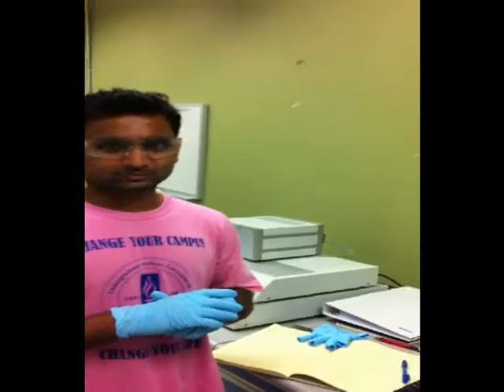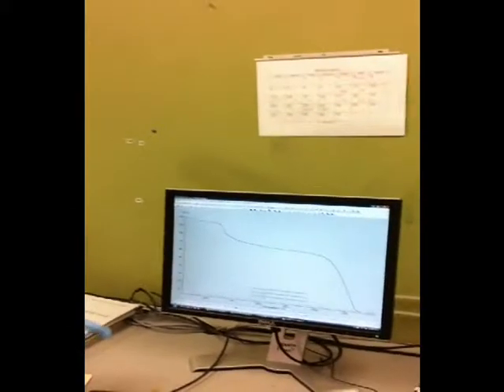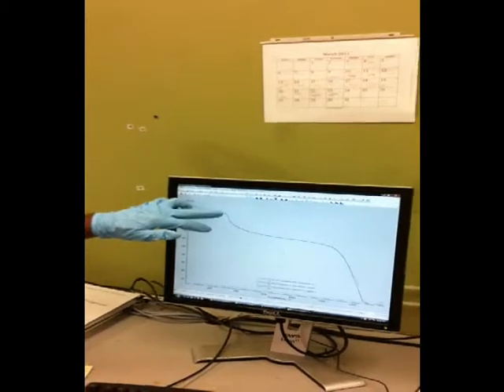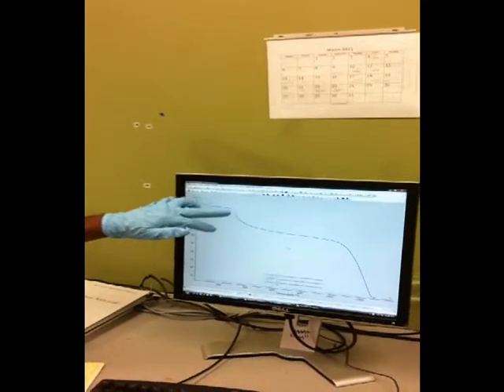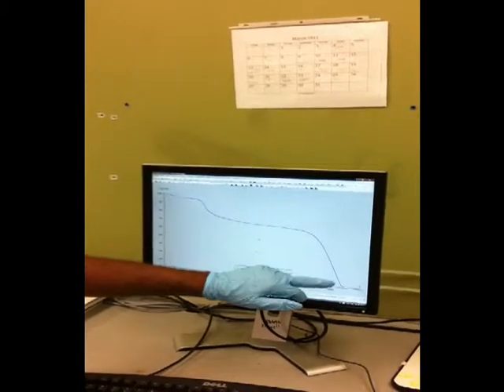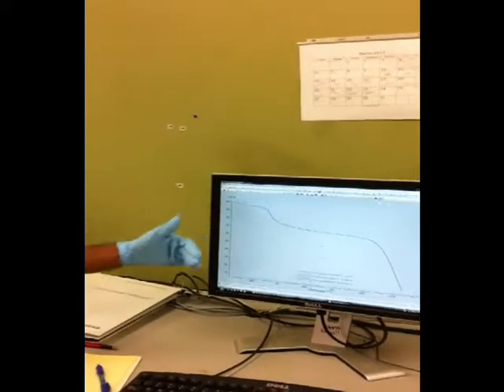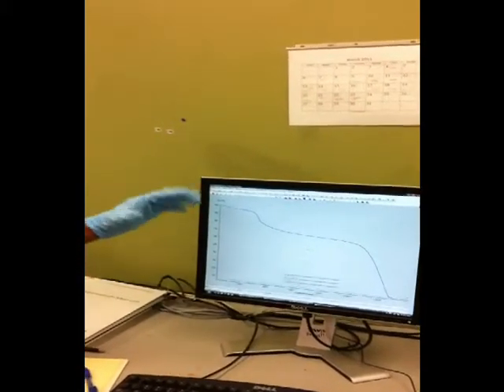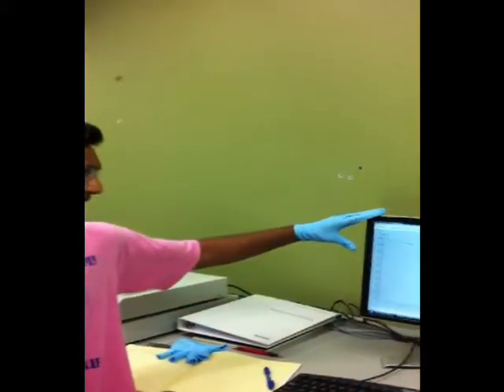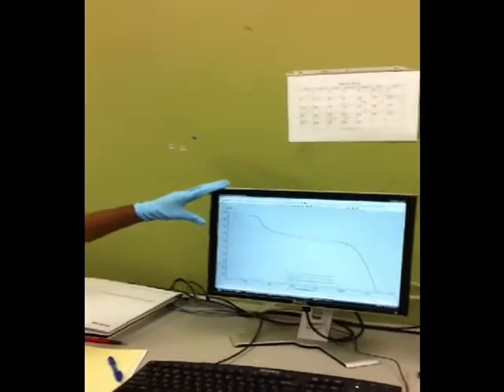Alright, so now we have our results after 5 hours of waiting, a long time. The first curve represents the char reacting with carbon dioxide. Then the second curve represents the coke reacting with carbon dioxide. We're going to do several experiments similar to this. Then we're going to make a model using these types of graphs, which will represent the quantity of char and coke, and we're going to use that.